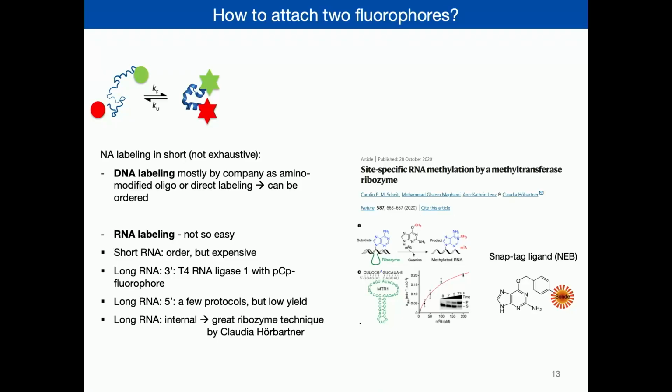It transfers exactly that fluorophore and this group here to your target, and you get a labeling efficiency of around 60 to 70% as well. And this works obviously with a lot of SNAP-tag ligands that are commercially available, but we are also at the moment exploring options of making our own fluorophore conjugates with this kind of a start product here.